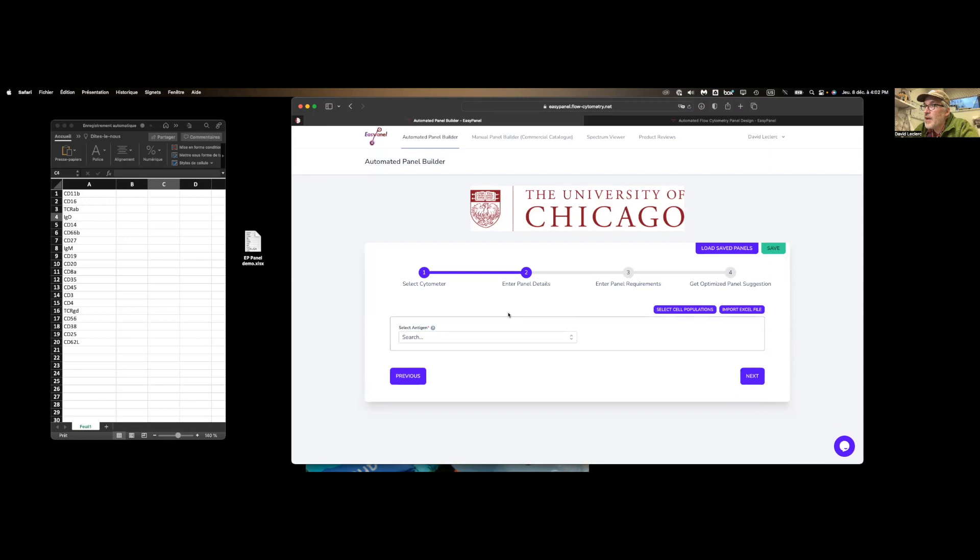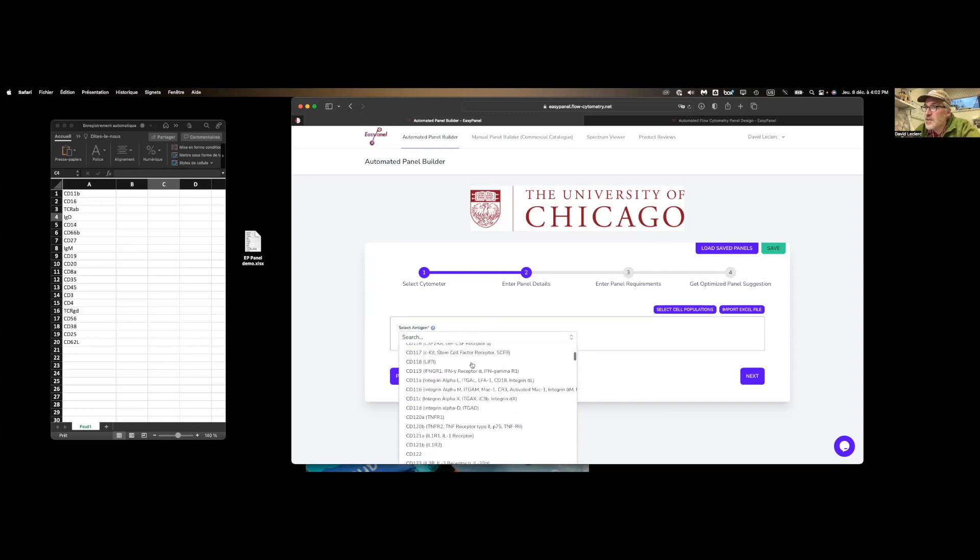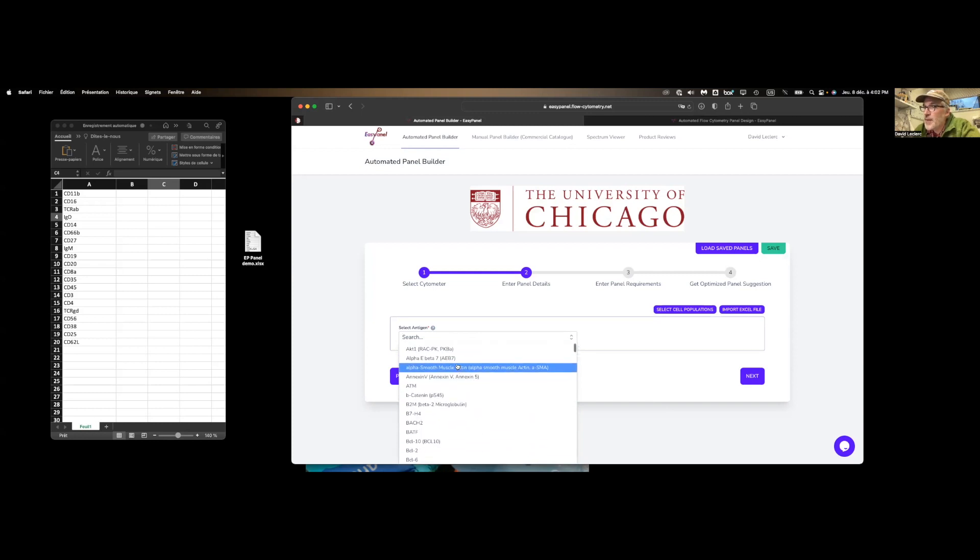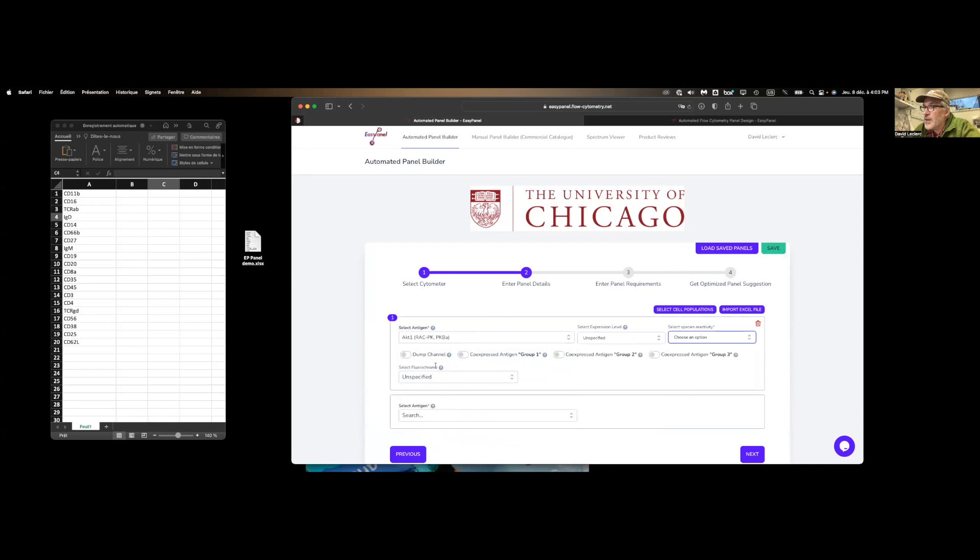Second step, enter your panel details. So here we're going to introduce all the markers that we want to look at in our panel. We can do it manually by typing in all these different markers. There's a list over here as well. As you enter a specific marker, you select the expression level, the species reactivity, and then you can group your different markers in co-expression or biological co-expression groups.